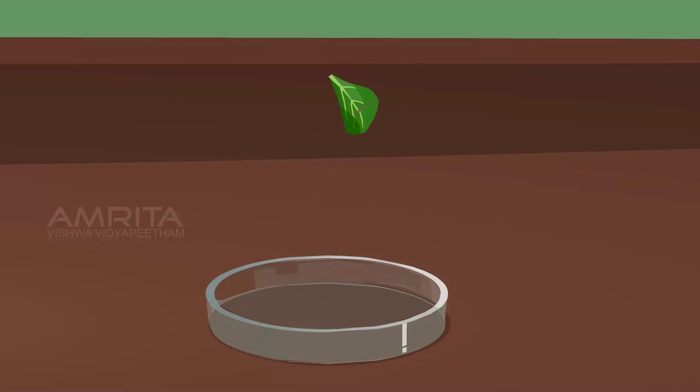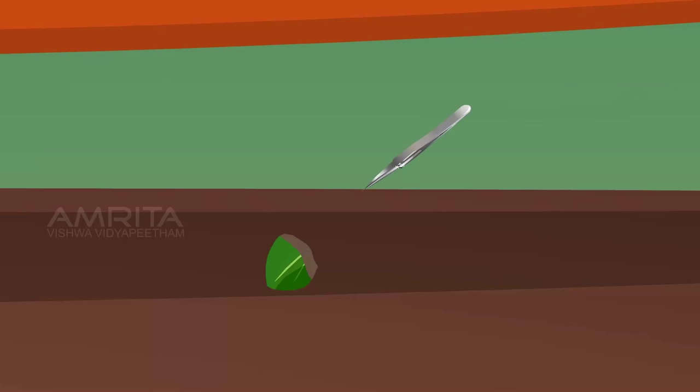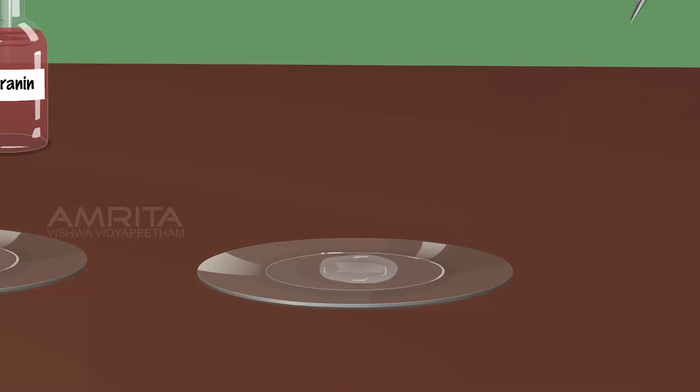Take one fresh leaf of Petunia plant from the petri dish. Fold the leaf and tear along the upper side of the leaf. Using forceps, pull out a thin transparent layer from the upper epidermis. Put the peel into another watch glass containing water.